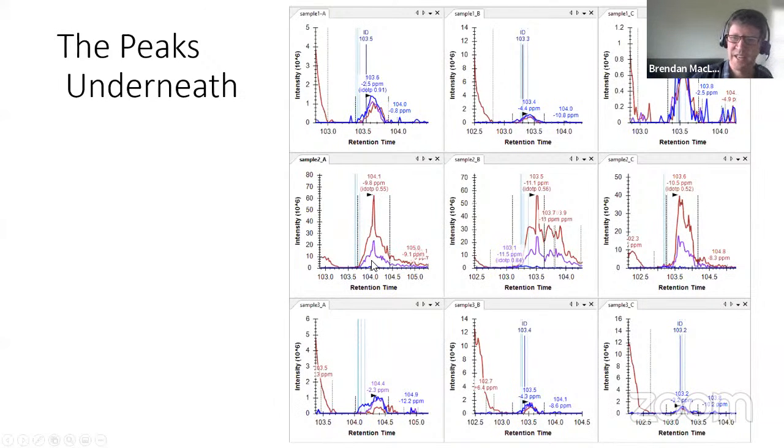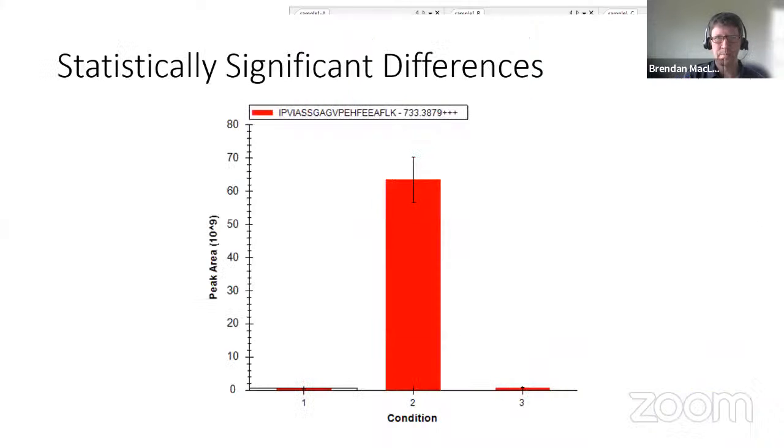It's very hard to imagine, but maybe you could say, oh, this thing over on the side here, you can see all the IDs are kind of lining up over here. So maybe there would be a way to get some signal out of the monoisotopic that you could use, but boy, it's hard to say that for sure at this point. So this may just be a case where with DDA you couldn't actually get a valid quantitative value. And I think other tools like MaxQuant would struggle with this case too.